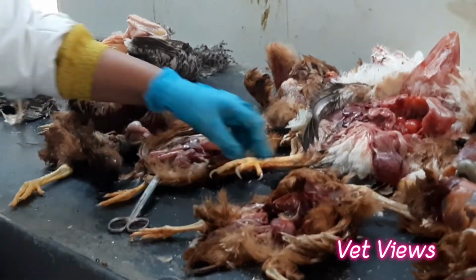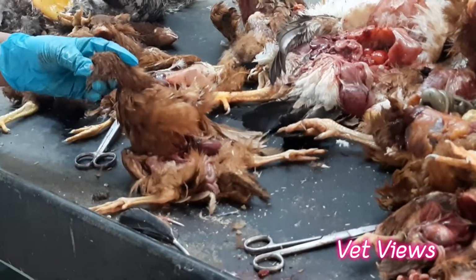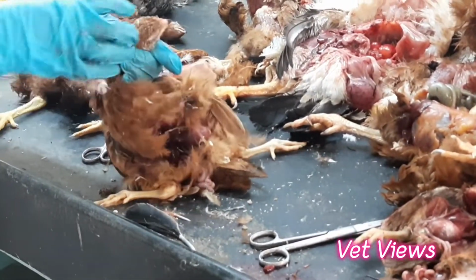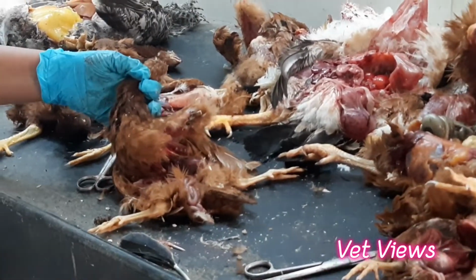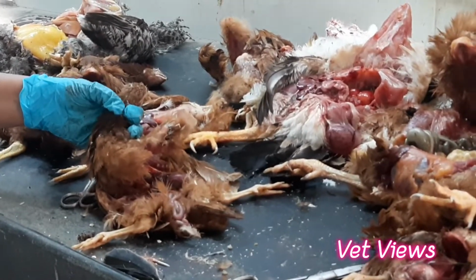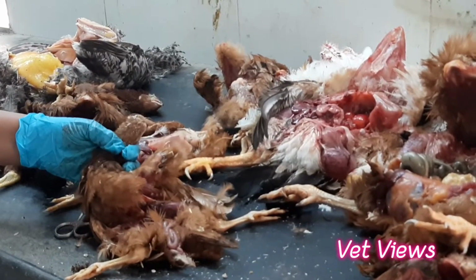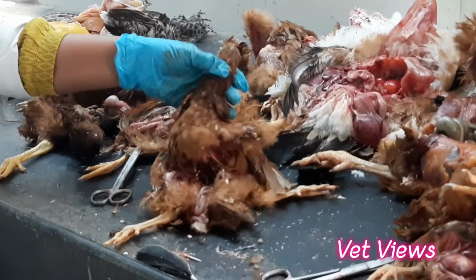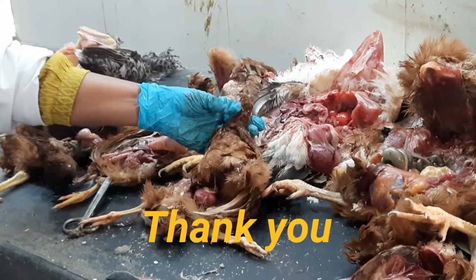Okay. And in some examinations, we also open the brain portion. Just cut open the head and then open the skull portion. You can see the brain. Mainly we observe the brain in two cases. One is heat stress. During heat stress, there will be hemorrhages in the brain. And in avian encephalomyelitis or encephalomalacia, it will be completely pale and degenerative changes will be observed. In normal cases we don't observe this. In those suspected cases, we go for observation of the brain.